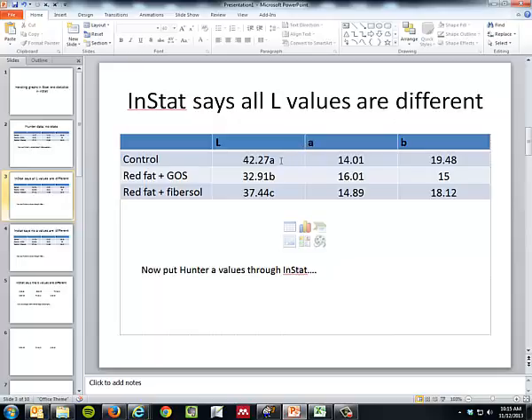So I don't have to do anything fancy here. I can just put the A, B, and C to indicate that they are different. And you'll see later I put a little note below the table that means within columns not bearing the same letter are statistically significantly different.